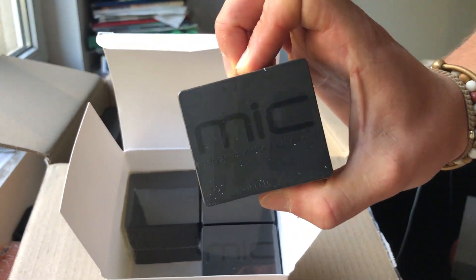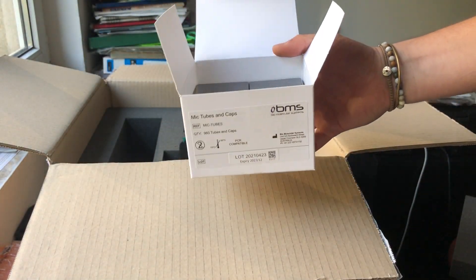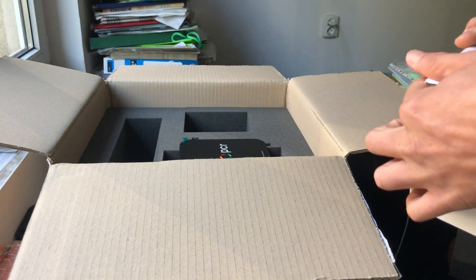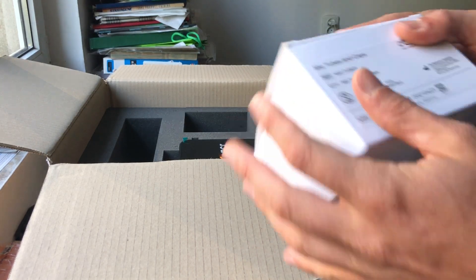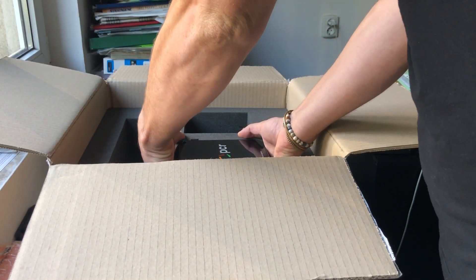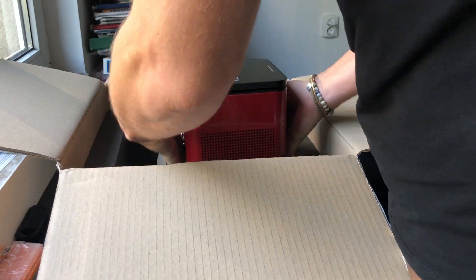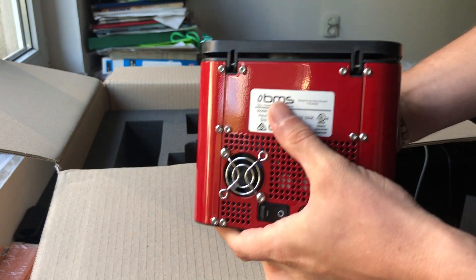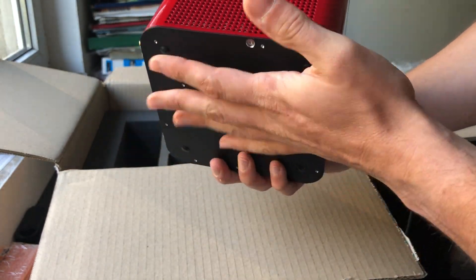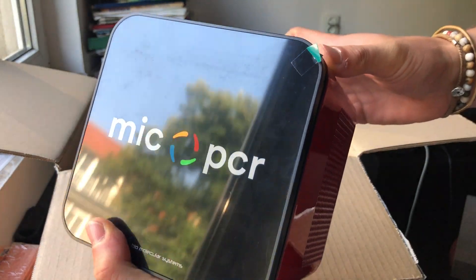How cool is that! Let me put this aside and get the PCR unit out — this is the first time I see it as well. Let's remove it from the box carefully. So here it is — it's small and seems very well built. If I'm not mistaken, it's made in Australia.